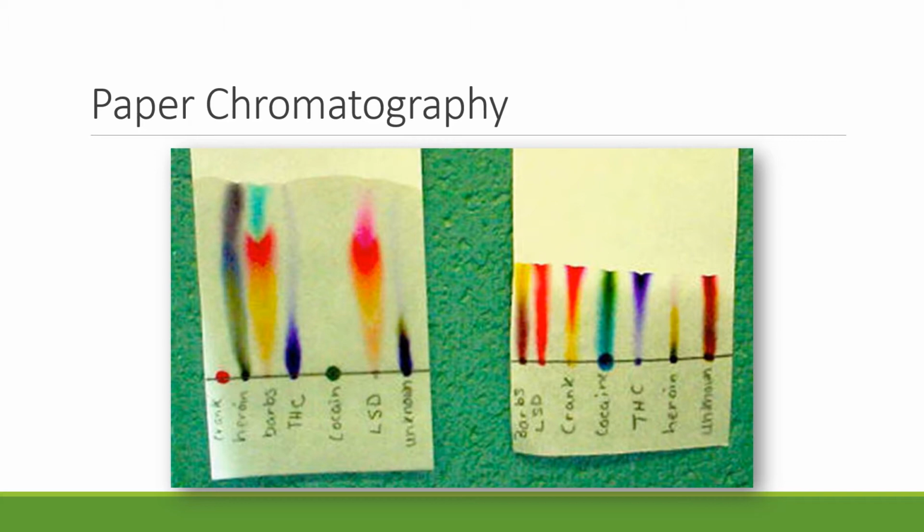All right, and so this is a neat little example that shows that if I have all these different substances in which we added the color to separate it out, and we have an unknown substance, I can then compare it to what is likely. And here we're looking at different drugs.